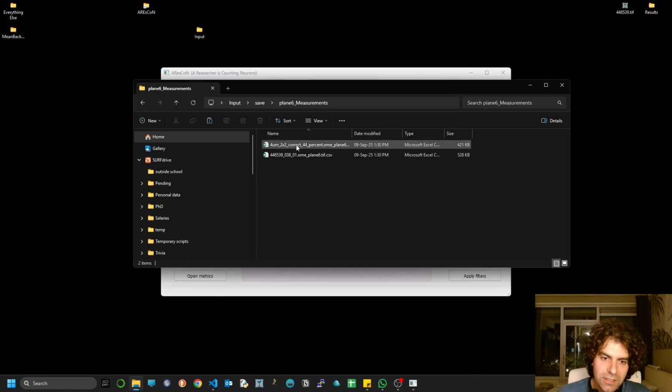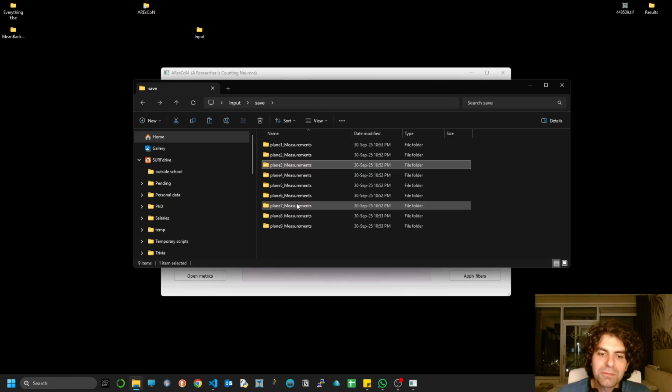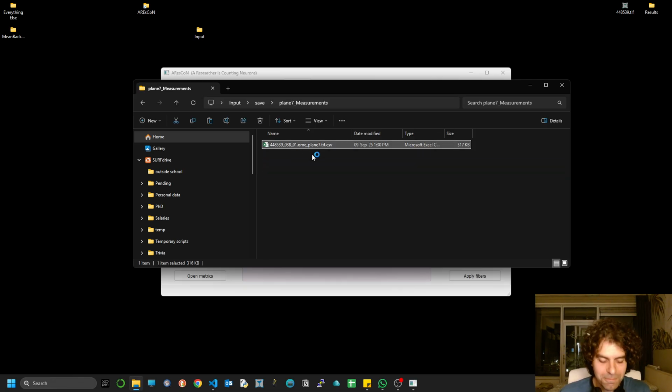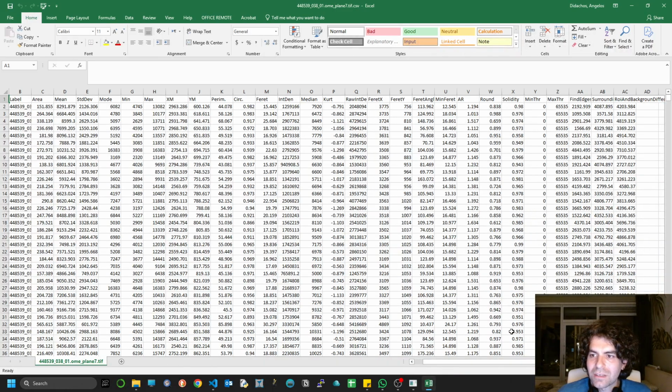I sort of cheated because I passed another file that contains the information, so I don't lose time again, but it's not going to take much. Cool. So let's go to plane 7, for instance, and what you will see now is that apart from the defined edges that we've already taken, now we've added 2 more columns.